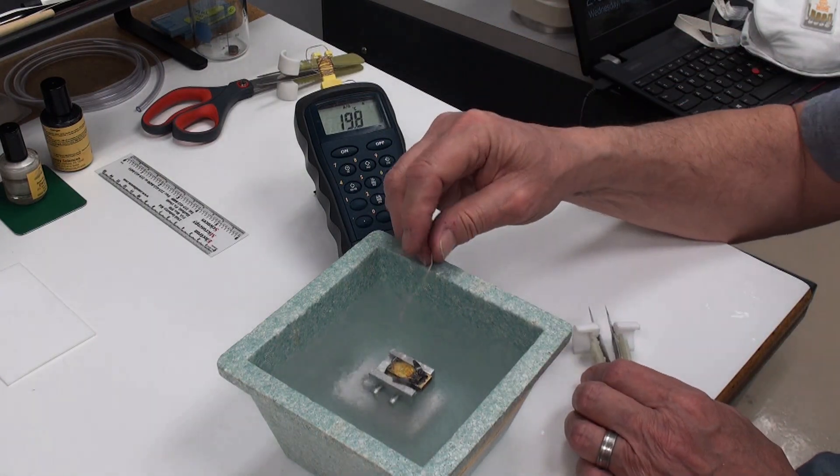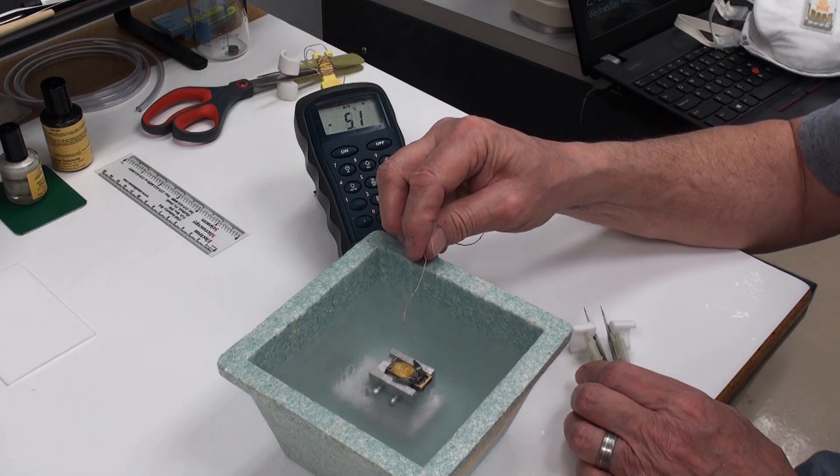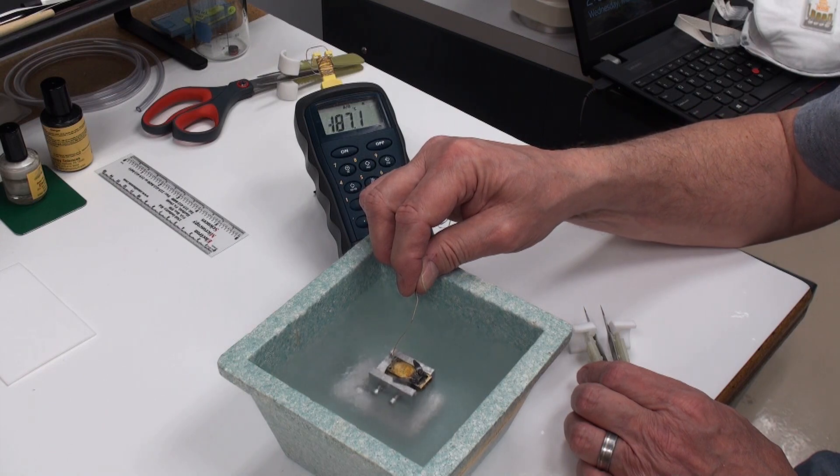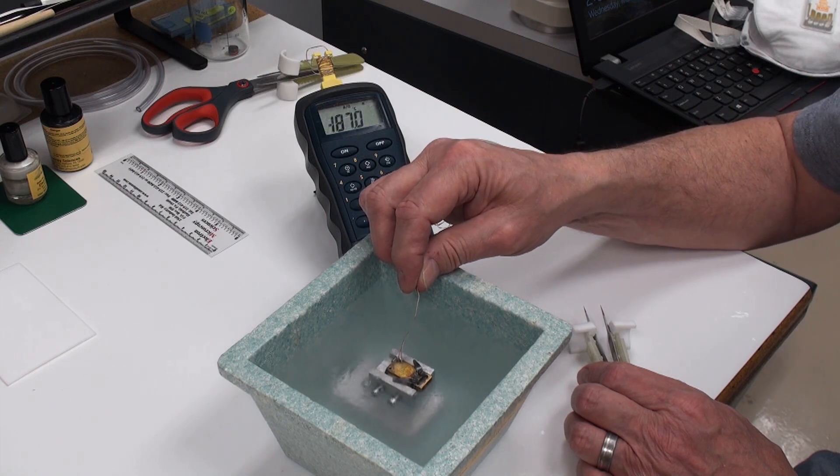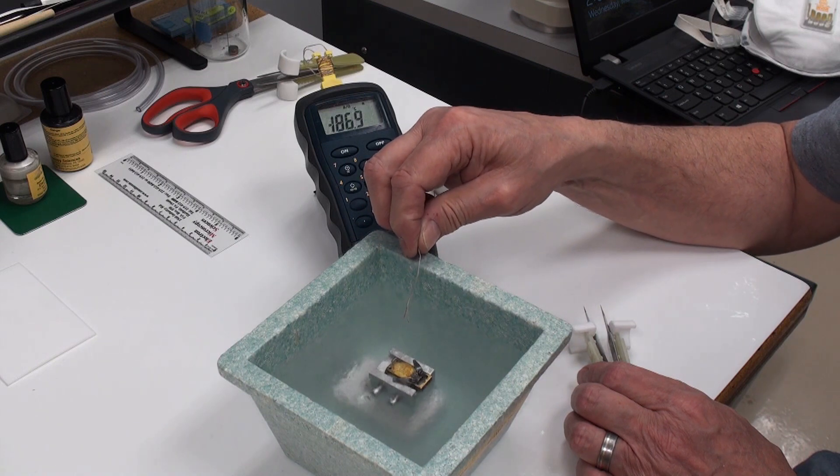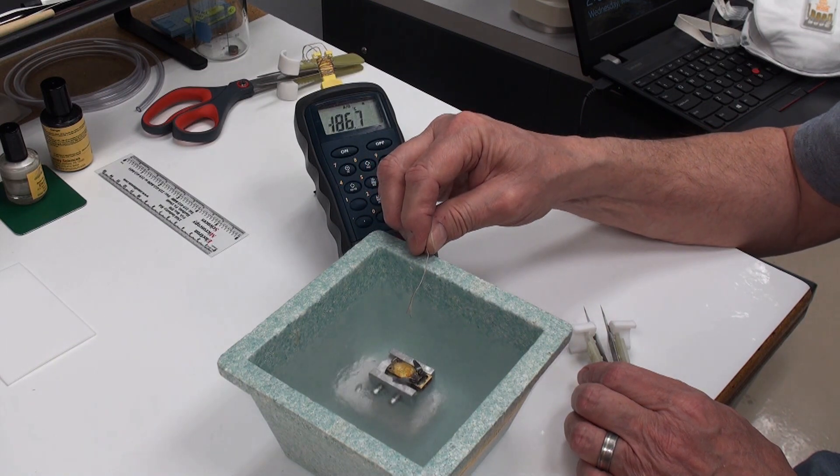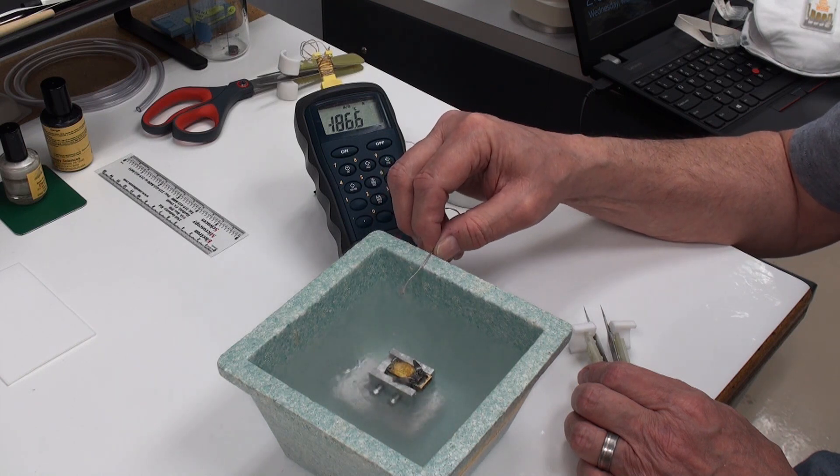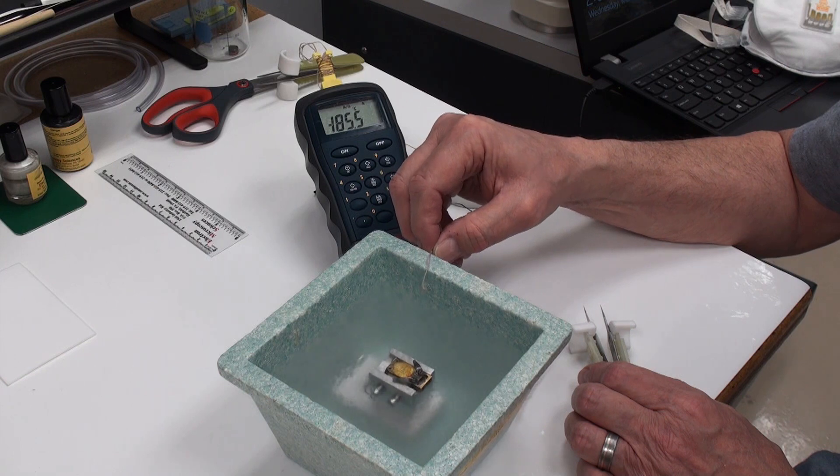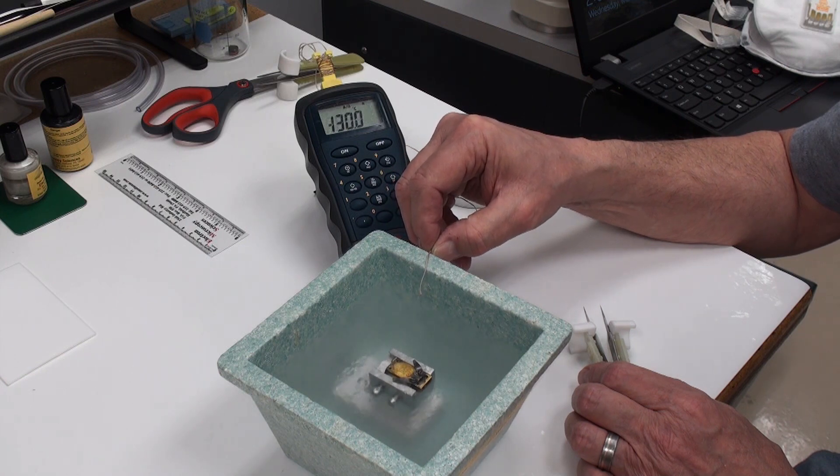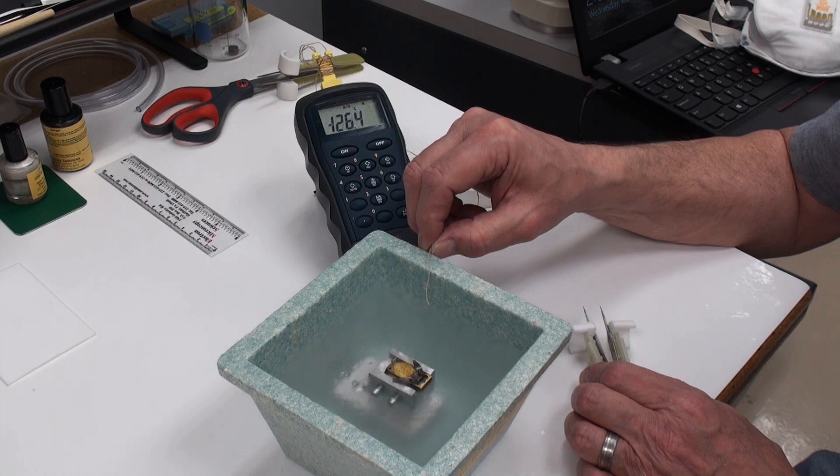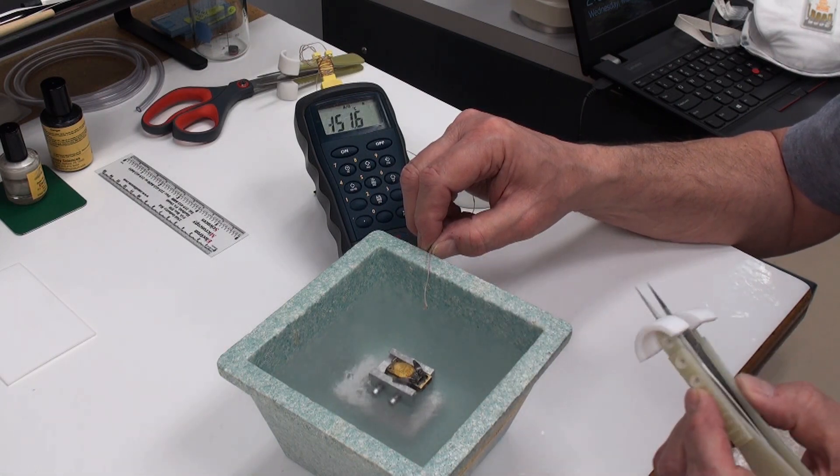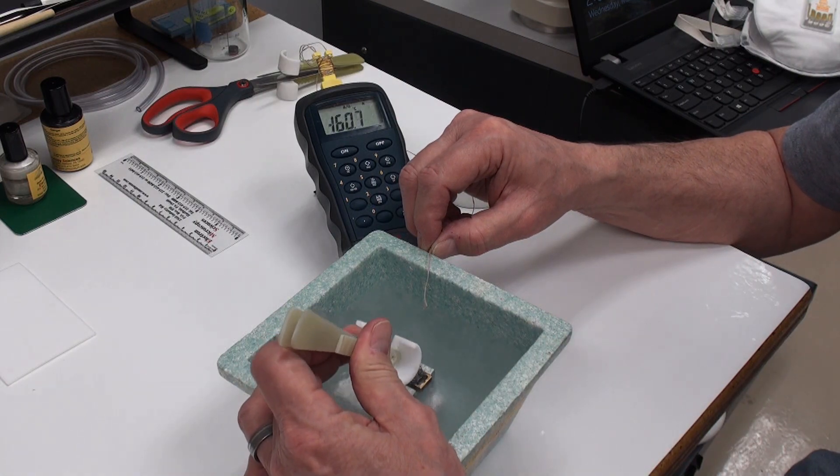And as you can see, where I was working, we're working at liquid nitrogen temperature right down to here, there's a cold nitrogen gas lake that comes up and basically just rolls over the brim. So it actually gives you quite a bit of leeway to work in a very cold environment for a prolonged period of time.